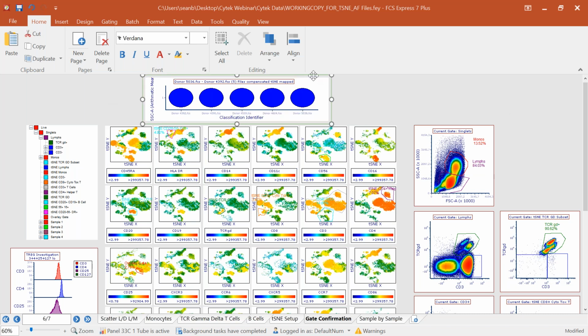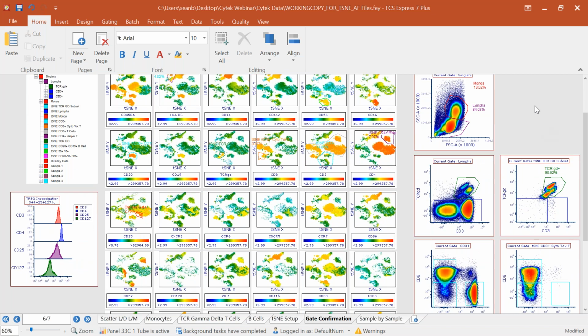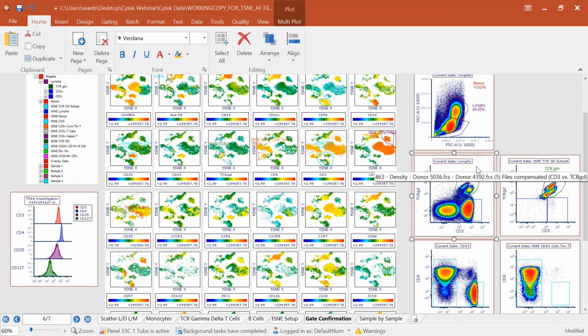We've also inserted what we call a heat map, and this is one way that if we need to deconvolve the samples, right, we had 5 samples merged together, how we can do that, and I'm going to come back and show you that in just a moment. But the idea, again, is being able to move between standard flow cytometry, a classical panel analysis, and using these exploratory tools.